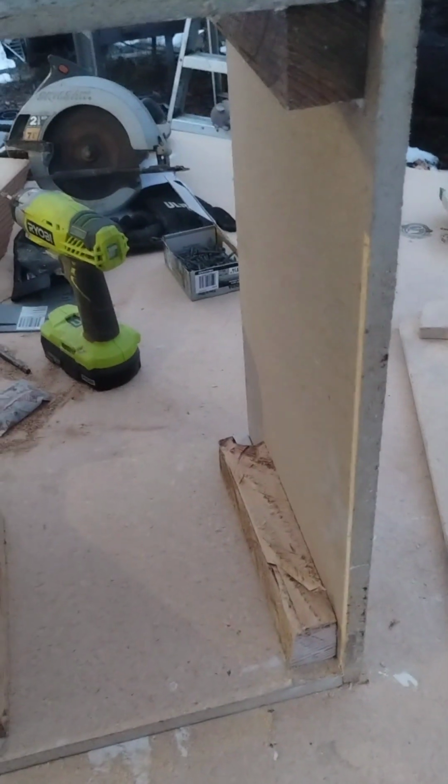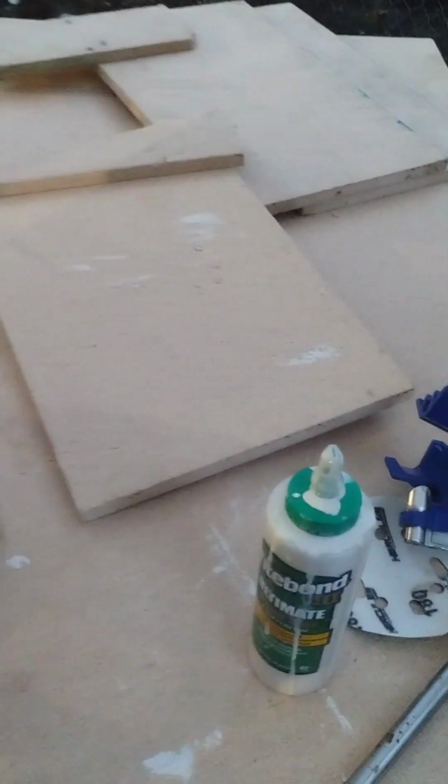It's pretty simple. The particle board's pretty soft, so you got to put these in to reinforce it, and then make sure you do the measurements for the back board that sits in there and the front for the filter. I'm gonna finish putting this together and I'll come back.